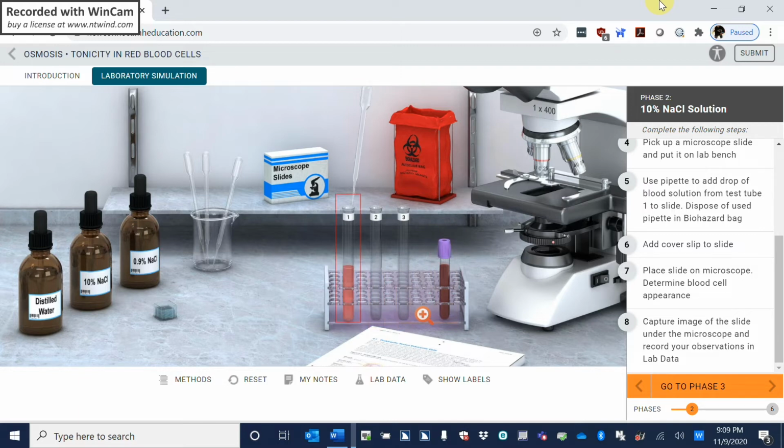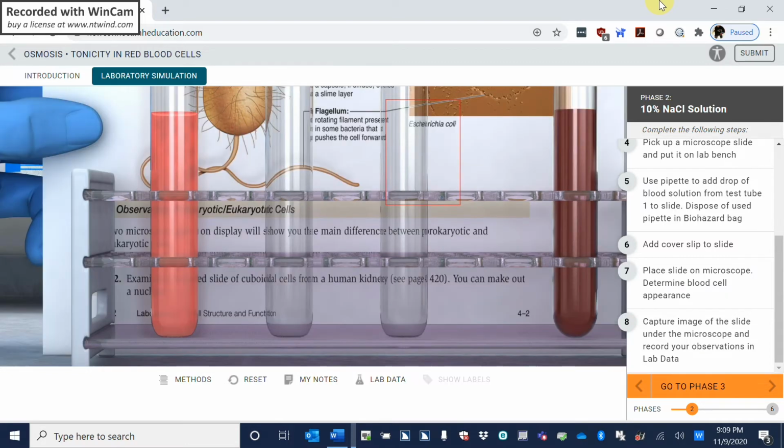Pipette dropped blood sample into the test tube. Pipette still selected. Select where to move it to. And now I need to dispose of the pipette. Move pipette to biohazard bag button. Lab table frame. Pipette disposed in biohazard bag. The scene has changed to a zoomed-in view of the 3 test tubes and the blood for comparison. A flash card with text is placed behind the test tubes.